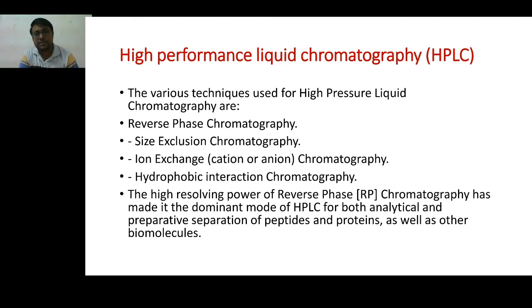In chromatography, there are two major phases. One is the stationary phase and another is the mobile phase. Stationary, the name itself indicates, is stable, which is not mobile. This stationary phase may be solid or sometimes liquid. It may be silica gel in some cases, or calcium carbonate, and in some cases charcoal.